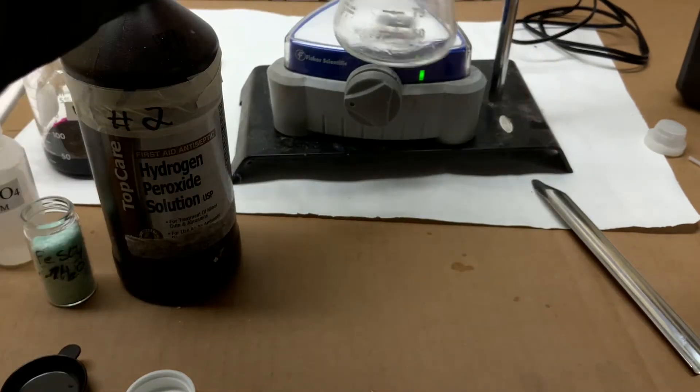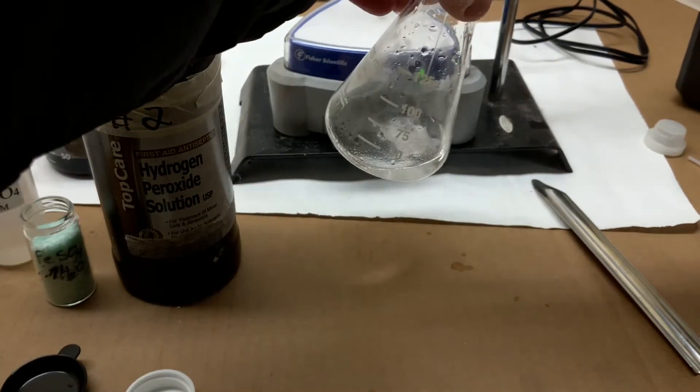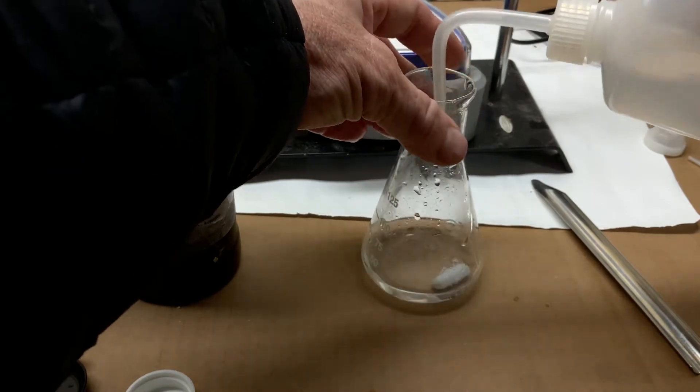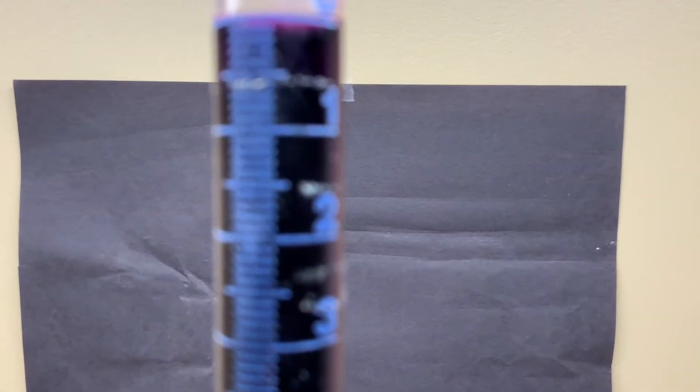Now I'll add the stir bar. Add enough water to cover the stir bar so that it can actually stir that small volume of peroxide solution.